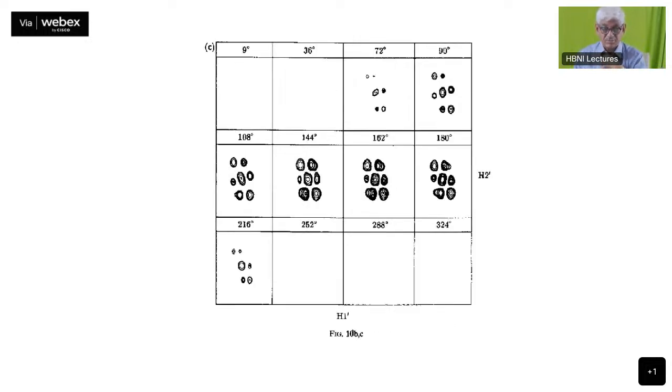And this is another experiment which is also COSY, but it actually is not a COSY 90, but a COSY 45. The last pulse in the case of doing the 2 pulse experiments can be a 45-degree pulse, or it also can happen in the case of what is called the E-COSY experiment, which we also described in the previous set of lectures. And here the number of components is reduced by half, and you can see a certain kind of an orientation. The patterns will slightly change.